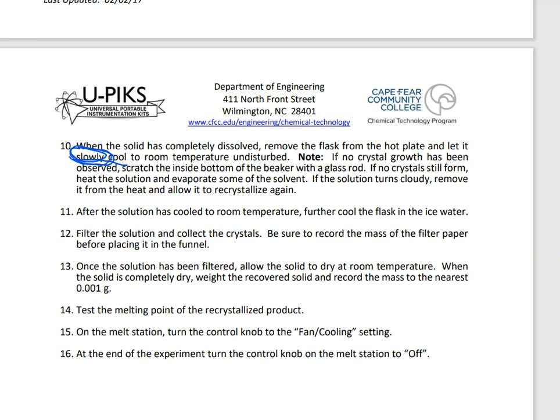Now, look at this. Do you see that word right there? Slowly, slowly, slowly. Do not take the flask and dunk it down into the ice bath. I've seen people do it over and over. Do you know what's going to happen? If you take your hot solution with your product that you have just dissolved and you shock it and it precipitates, it will go too fast and it will yet again bring the impurity into the product.